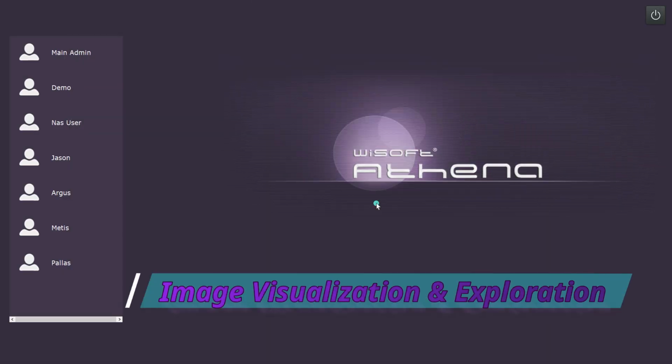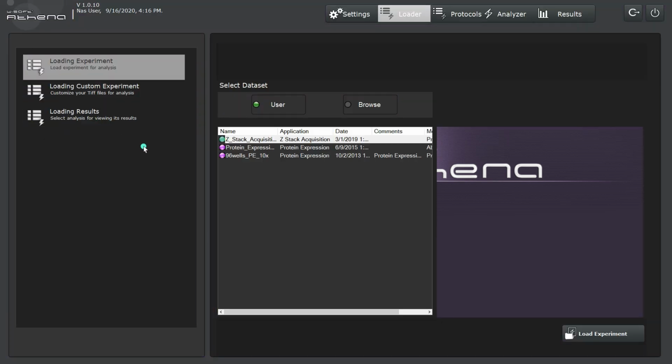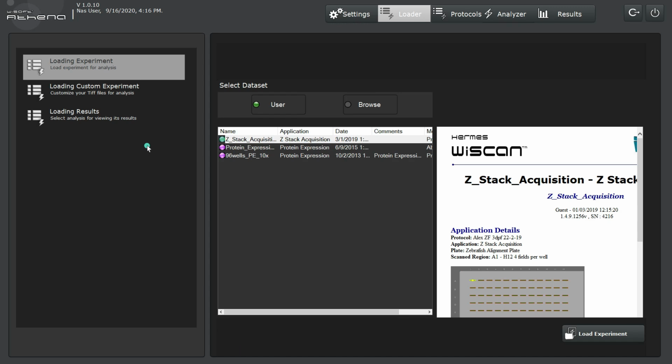In this video, we begin at the Athena Start page, access the results screen, and explore images in a dataset. From the Athena Start page, we select the desired user account on the left. On the Data Loader screen, click on the Results tab at the upper right of the screen.